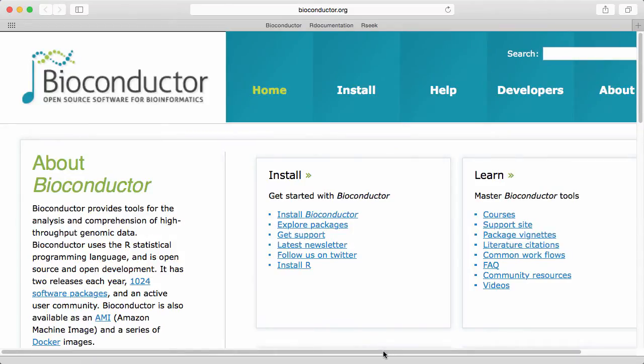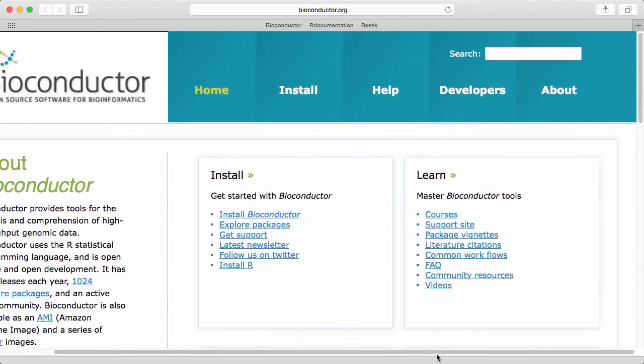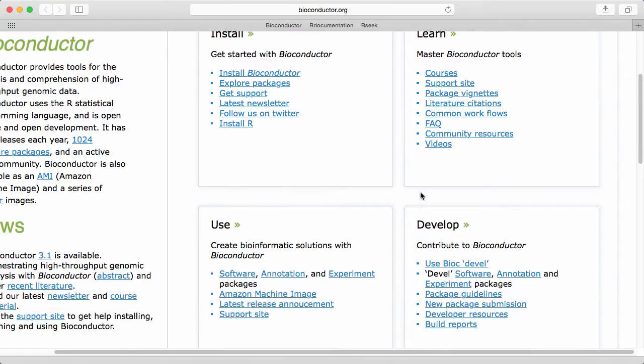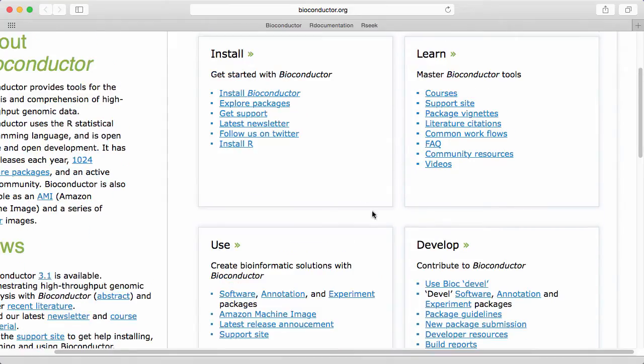The Bioconductor website contains a lot of useful information. It's organized into these four different categories here with install, learn, use and develop.